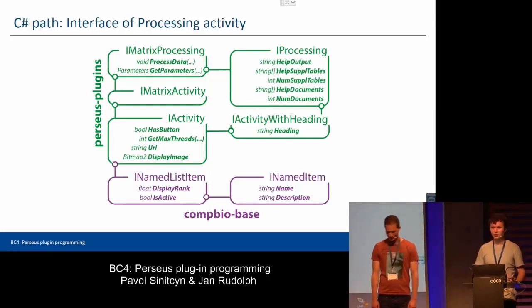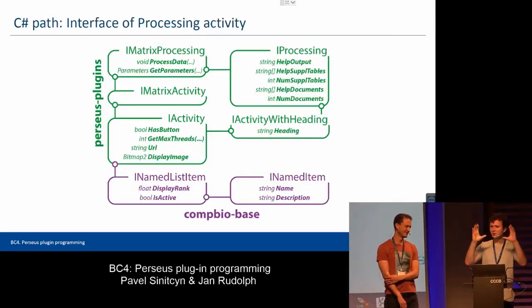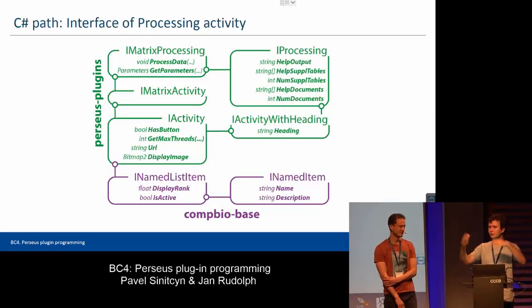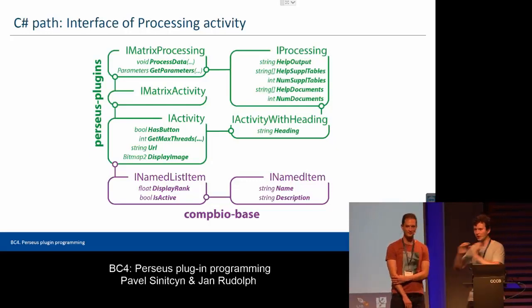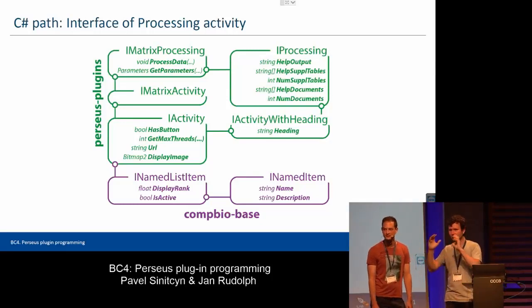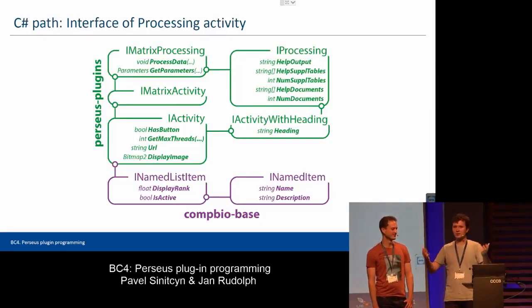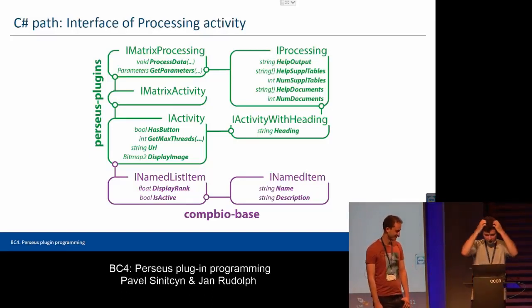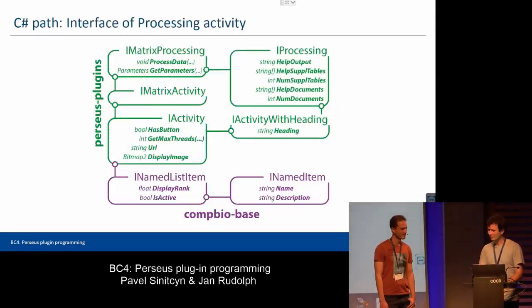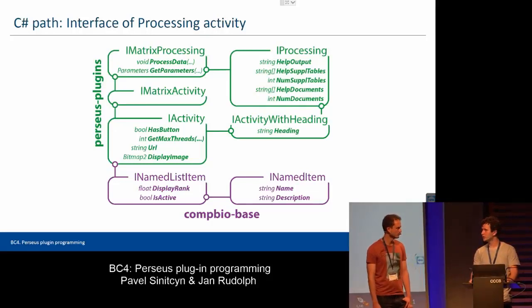So as a result, we decided to move to another strategy instead of going like an academician, start reading code, and after 2 days, if you had good memory, you can start directly programming. Instead of this, we're suggesting you destroy Perseus. Basically, program something which will destroy it. It's how kids learn to do something. And okay, let's start to do this. What do we need for this? For this, we need to create first of all a C# project.